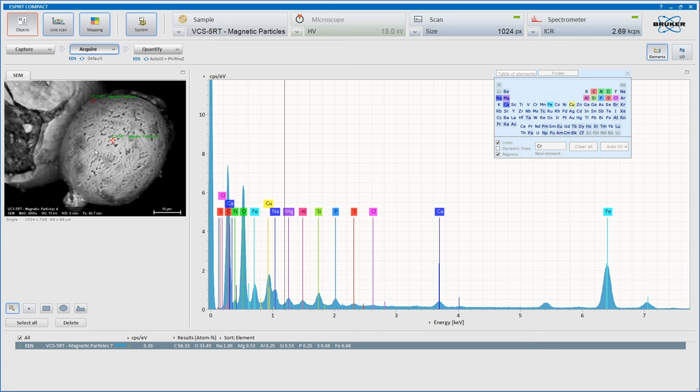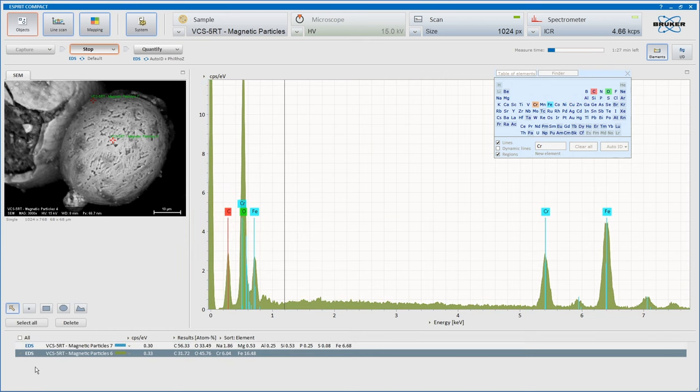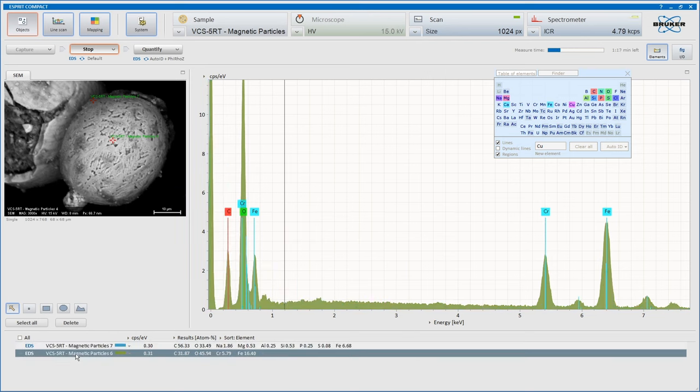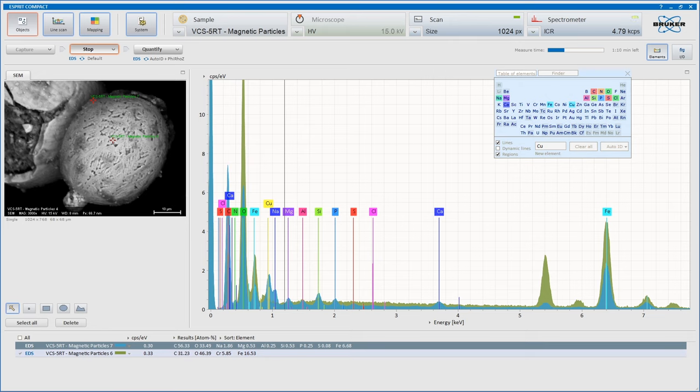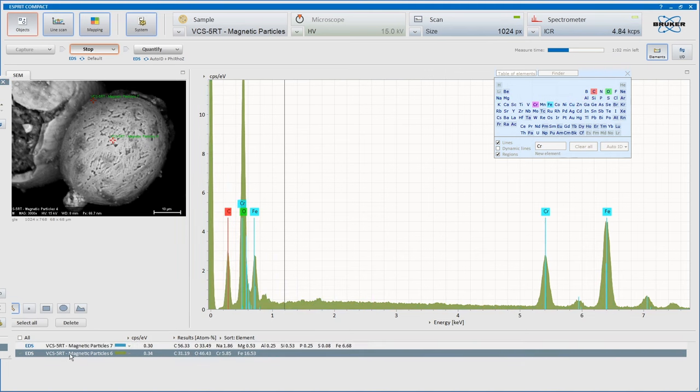So let's see what this one finds, relatively. And we'll go acquire. Turn off that one for now. It's definitely seeing the chromium that time. Not really seeing the chromium here, is it? I mean, it's there, but it's not really there. But here, interestingly, it didn't find the calcium peak which we determined there. And there's no calcium on this particular one. It's essentially iron, chromium. So this definitely has the chromium in it.